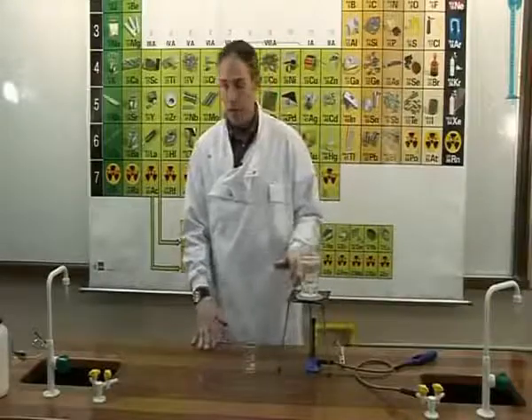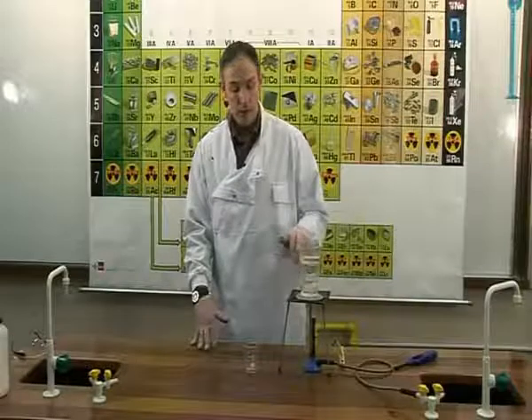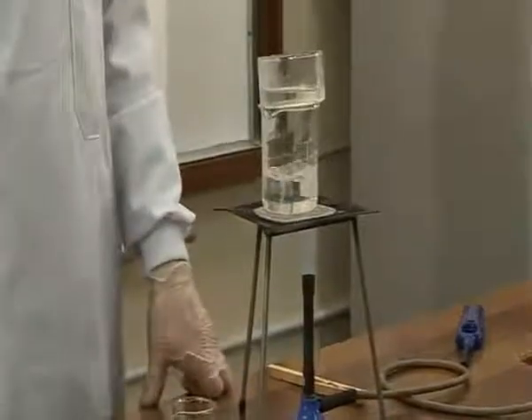The water in the water bath is being heated by the Bunsen. It turns to steam. The steam heats the dish, and the water in the dish will evaporate, leaving us with the salt.